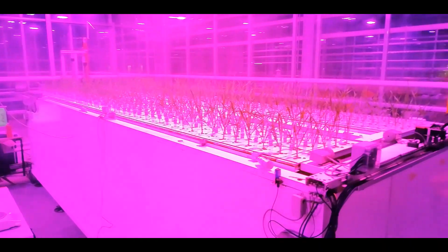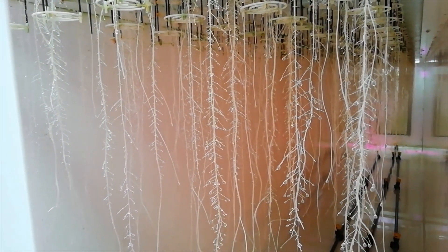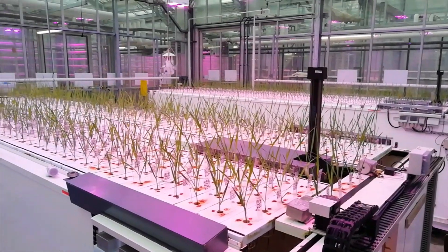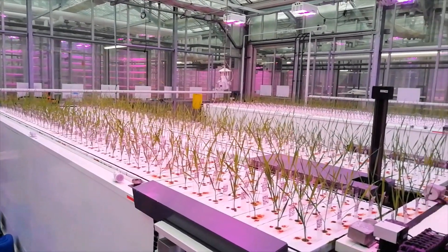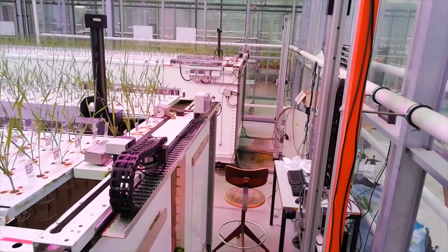The phenotyping data of this experiment will be used for a genome-wide association study, with the aim of finding QTLs that control a better nitrogen use efficiency and water use efficiency.